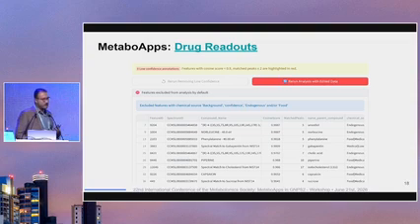And also, based on how strict you are, you can change for a higher number of matched peaks based on what exactly you want to see. And as you change that information, as I said, you can do the restart session on the initial page, or in this case specifically, you have the option just to rerun the analysis based on the new parameters that you selected.